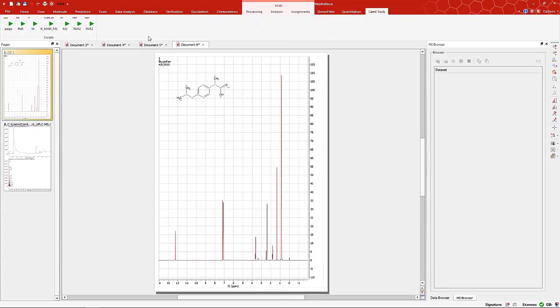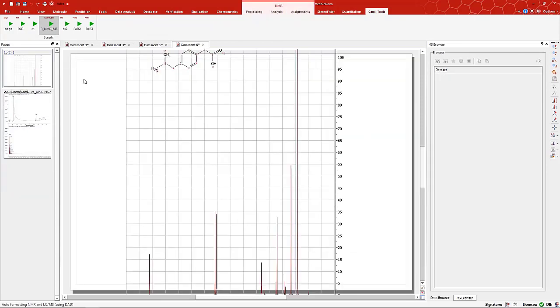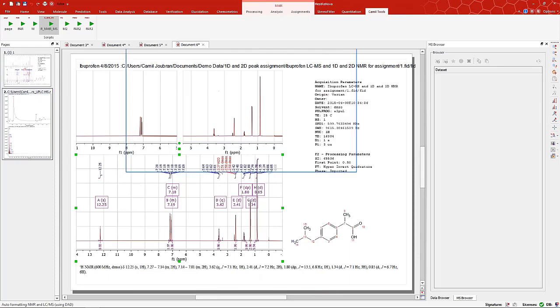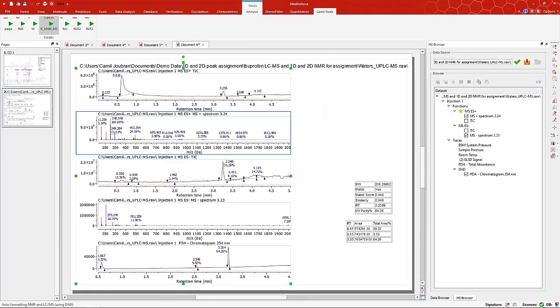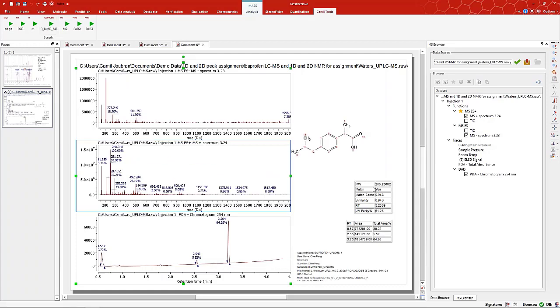So go back to tools, and I'm going to run the NMR MS script. What that's doing is this particular company wanted the NMRs and the mass specs on one page for each molecule. It's going to manipulate the proton spectrum and split it into two, give you two insets, upfield and downfield on the same page. It's also going to generate the peak tables that we saw previously for the mass specs. That's what it's doing now. And it's doing a molecular match.